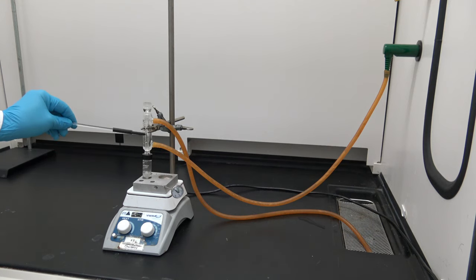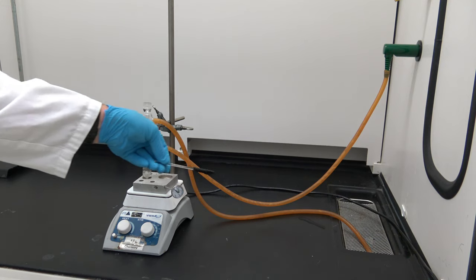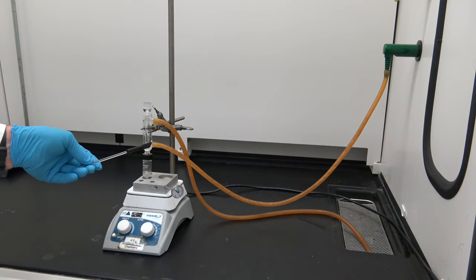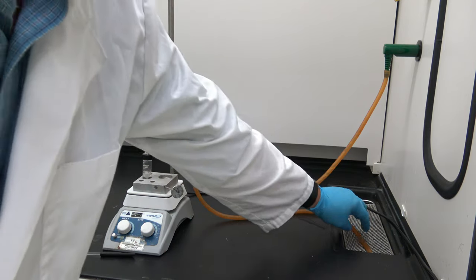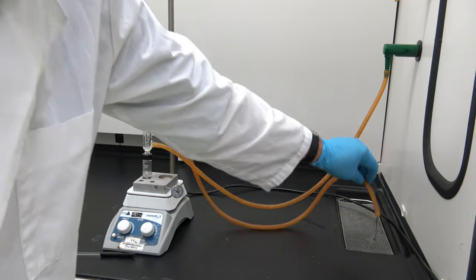It is two glass tubes, an outer tube where water is flowing through, and an inner tube which is open to the atmosphere. We have water coming in from the water spigot to the lower connection of my water jacket, and I have my upper connection going to the drain. And I'm now going to show the water draining. Notice I just have a slow trickle of water going through there.